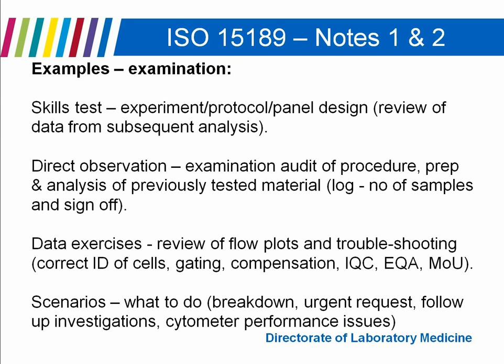It's always a good idea to, at the same time you carry out a competence assessment, do an examination audit at the same time. So essentially kill two birds with one stone. Not only do you competency assess the individual, you actually get an examination audit out of the process. Can the individual review flow plots? Are they able to troubleshoot the instrument, identify problems that have gone wrong in terms of gating, compensation? Can they correctly identify cells and so on?